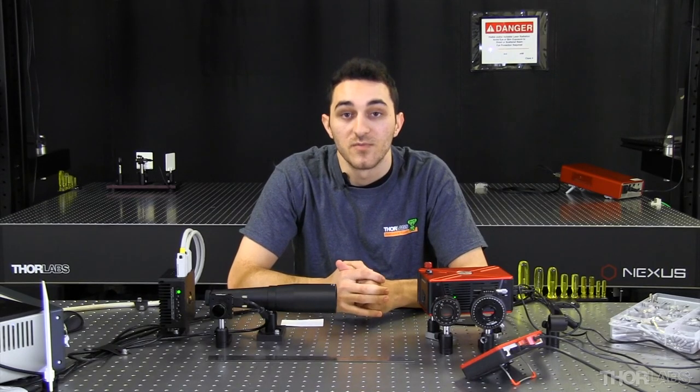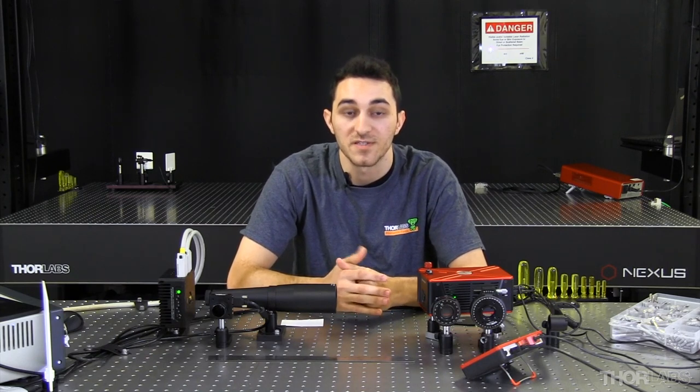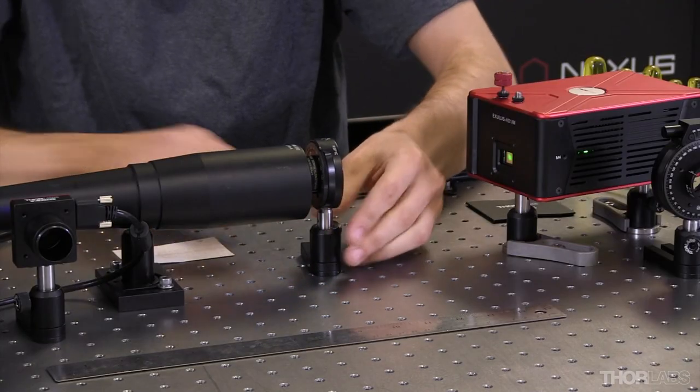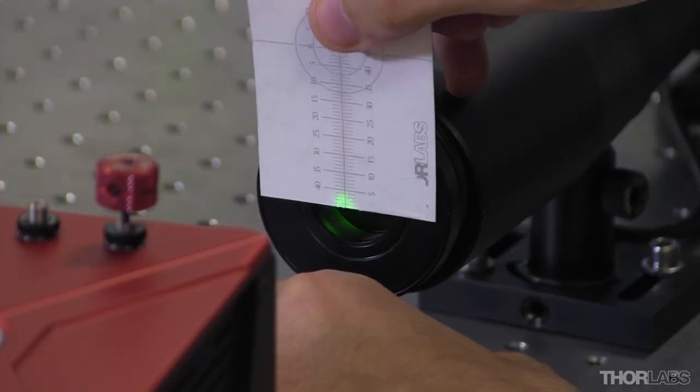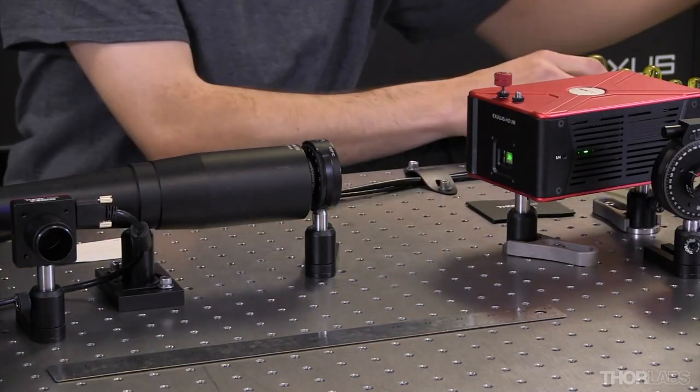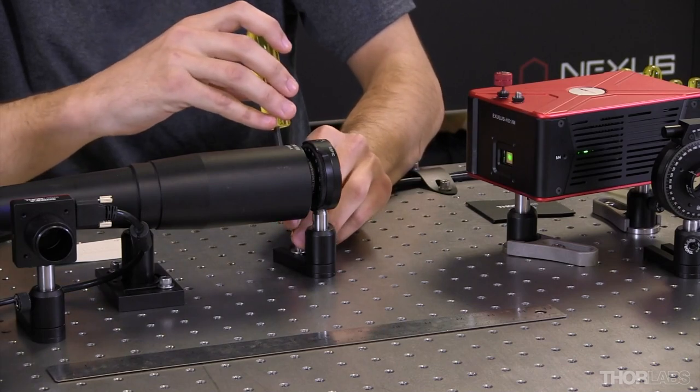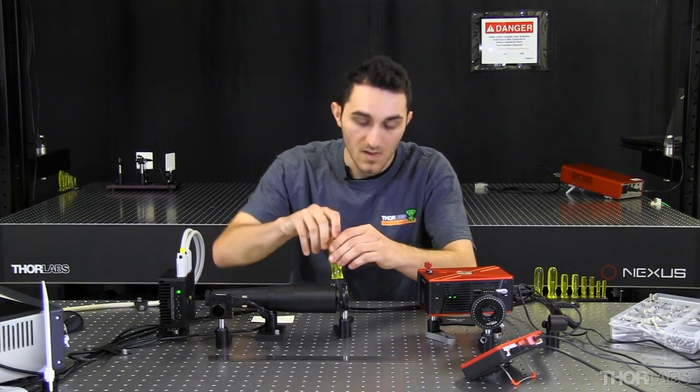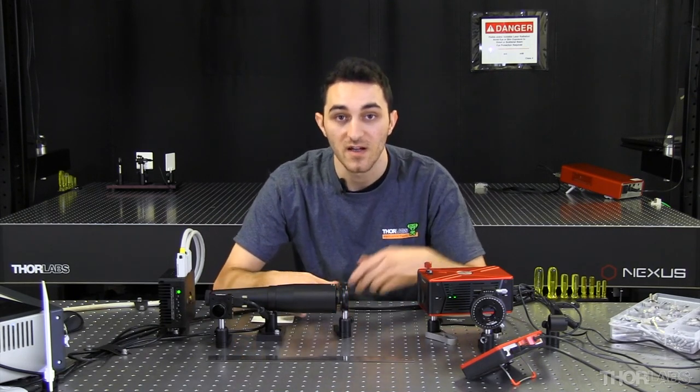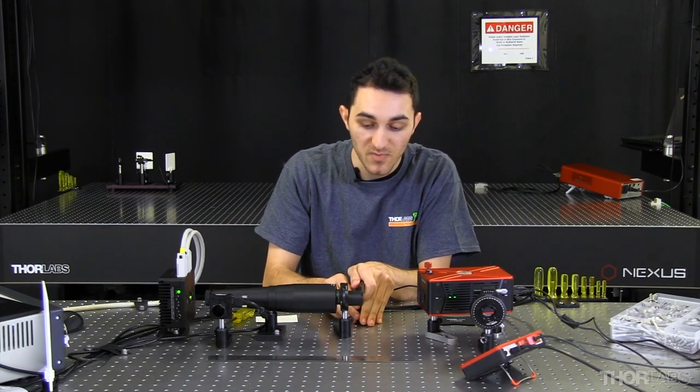Next, I'm going to improve the polarization extinction ratio of the light incident on the SLM by adding a linear polarizer. I want to align the transmission axis of this polarizer with the polarization state of the laser. I can do this by rotating the polarizer until it transmits maximum power.